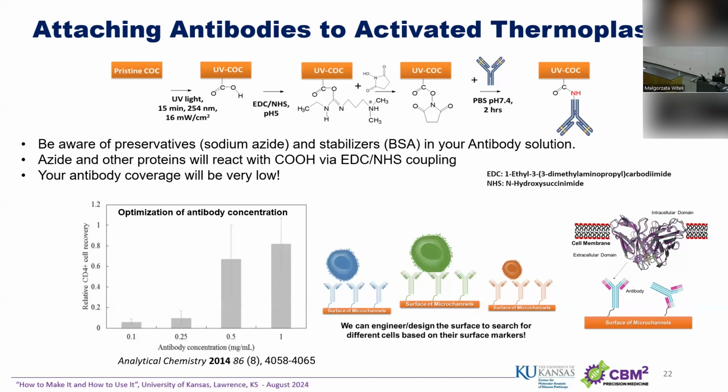I want to mention, as a practical aspect, when you buy antibodies, those are very often stabilized with sodium azide. Before you perform this EDC NHS attachment to the surface, you need to eliminate the sodium azide.